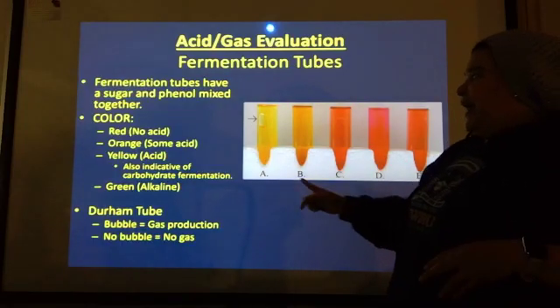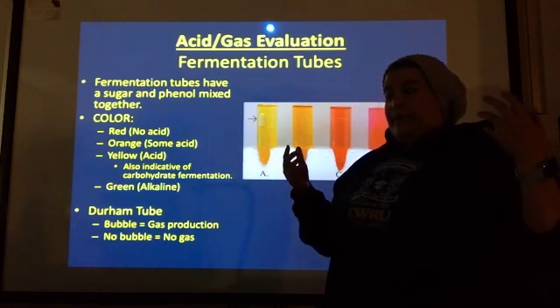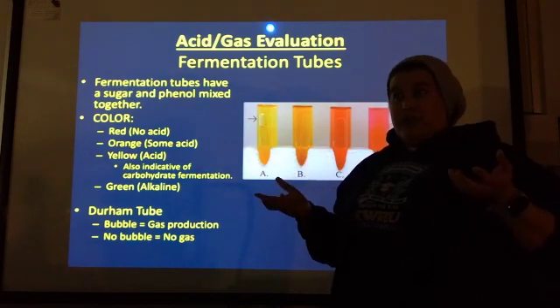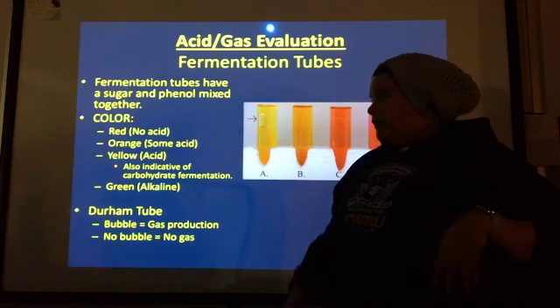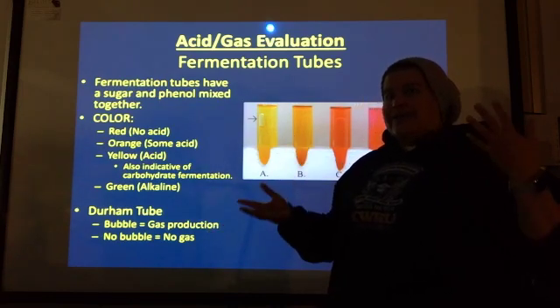In the past, I've had this phenol red, that's our pH indicator, turn green. I asked the company what was happening, and they couldn't really give me an answer, but it does happen, so that's kind of interesting. As far as the Durham tube goes, you can kind of also grade that.